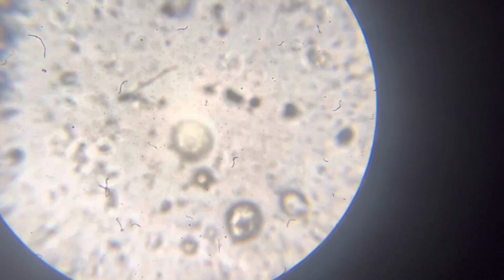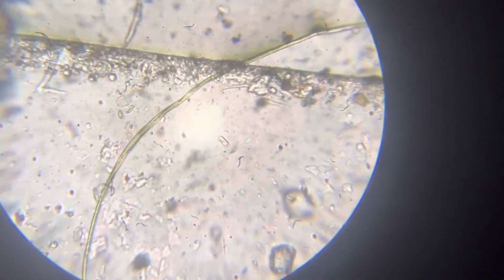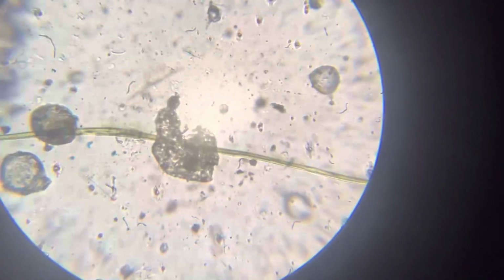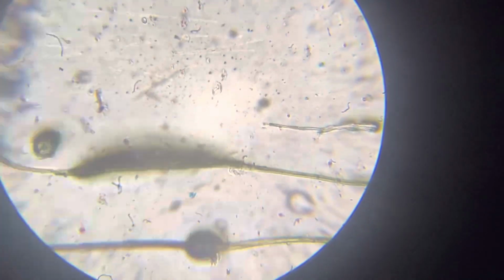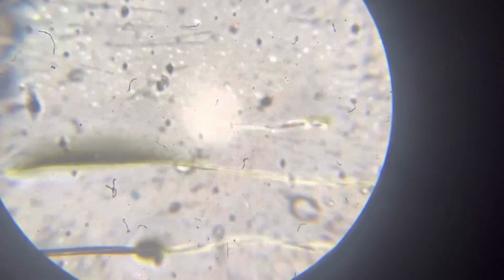This is magnification 160 now. With magnification 160 we can see more details of the sausage as well, which is interesting.